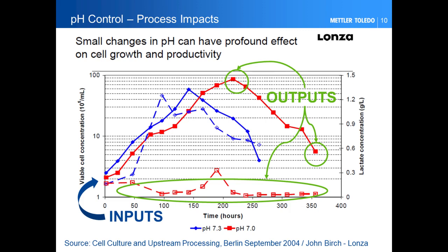And of course, the impact of the dissolved CO2 variations at various pH from 7 to 7.3 are not tracked here continuously to detect this pH anomaly. So coupling the pH and dissolved CO2 sensor to better characterize the impact of pH variation will help to better characterize the impact of dissolved CO2 on pH control at any scale, starting at small volumes.